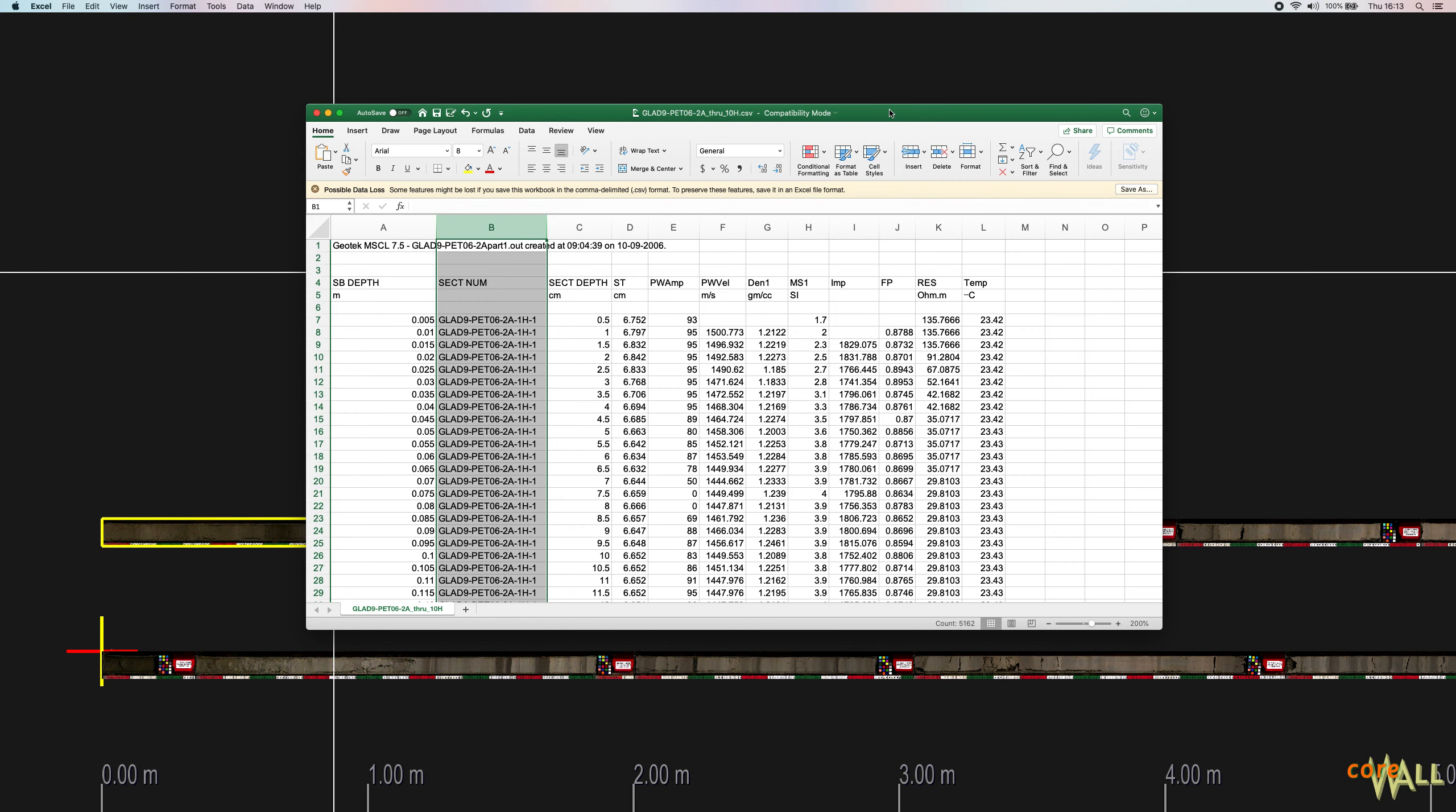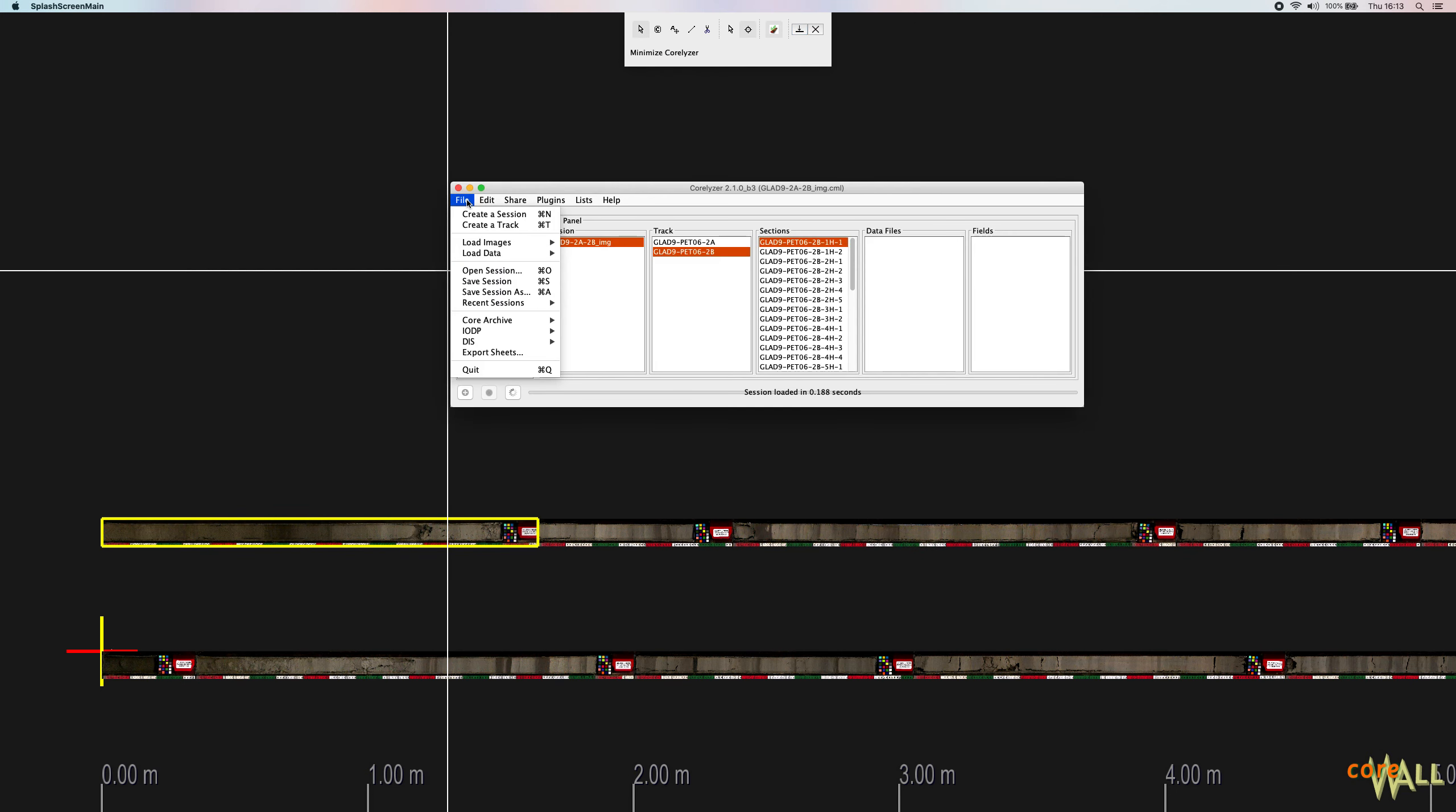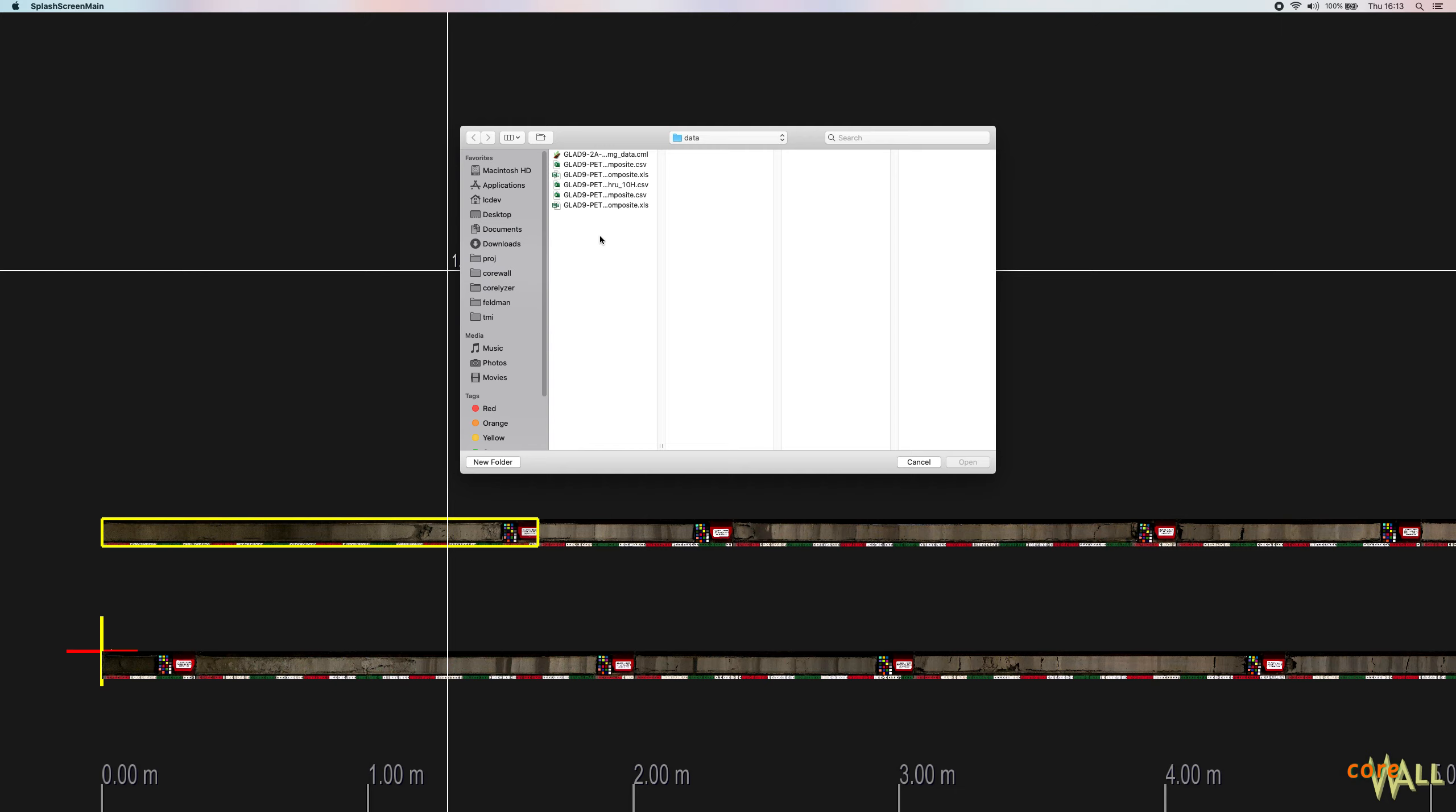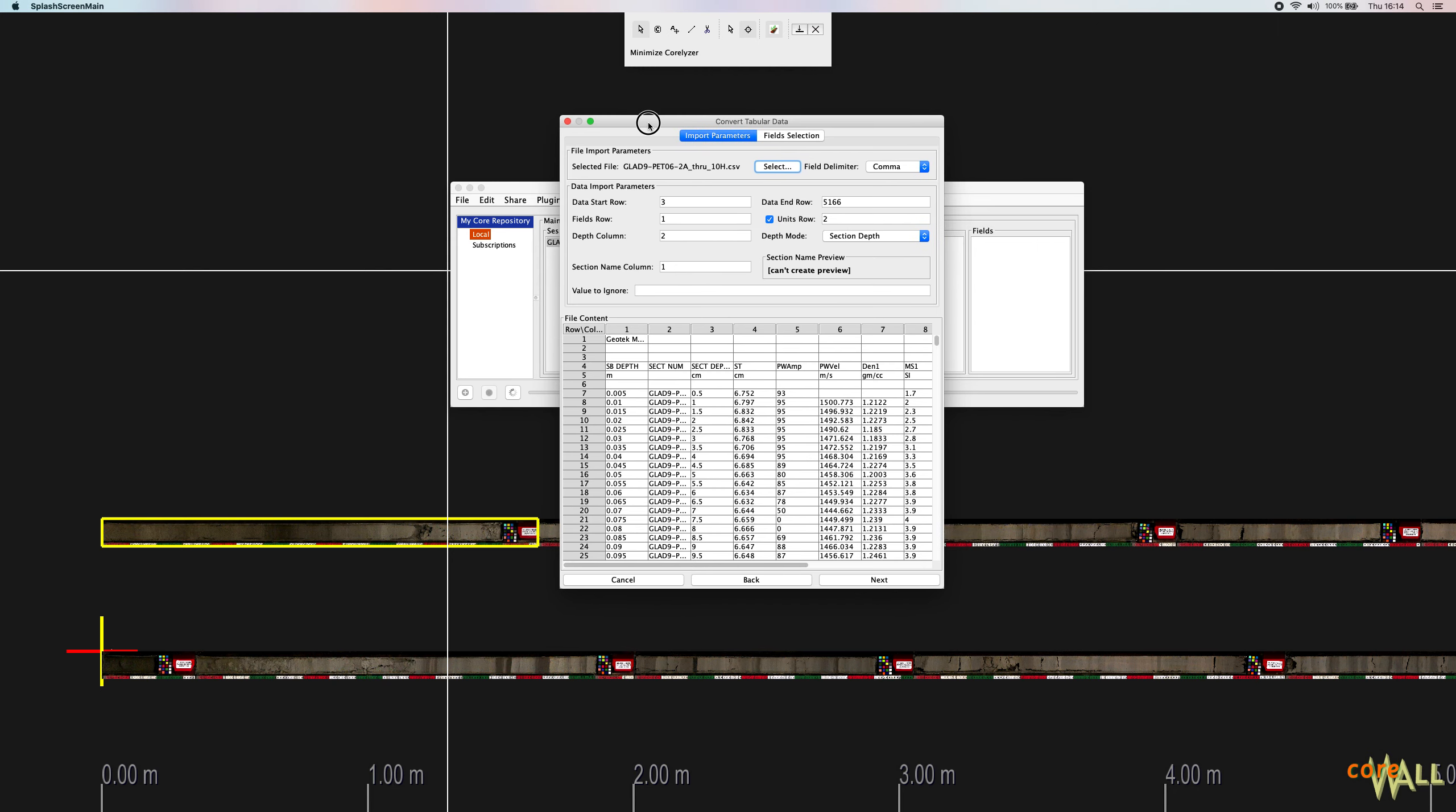So if your data is ready, then go to Coralizer and go to the File menu, go to Load Data, and choose Convert Tabular Data to XML to get started. Now navigate to the file that you'd like to import. This opens the Convert Tabular Data dialog.